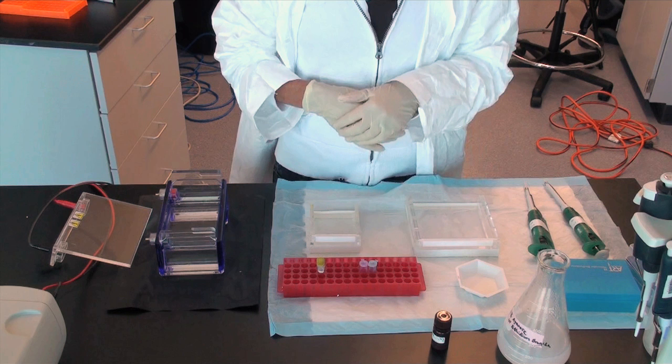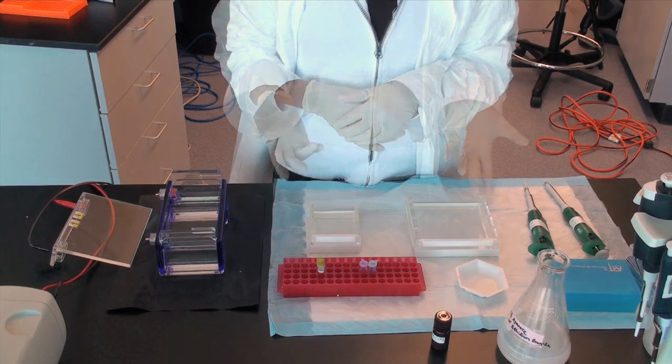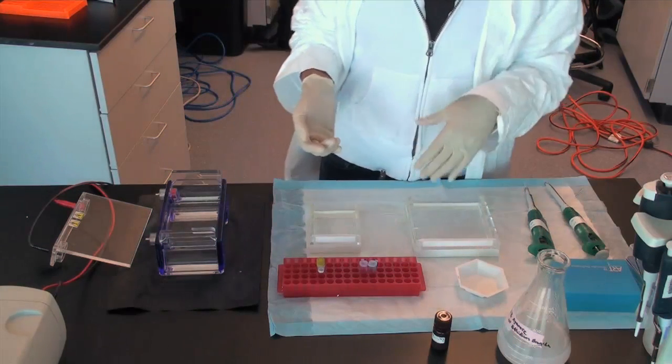If SYBR Green is used, then a little less is required to visualize the DNA. Add the staining solution before you pour the gel and make sure it is mixed well within the agarose and the TAE or TBE buffer.